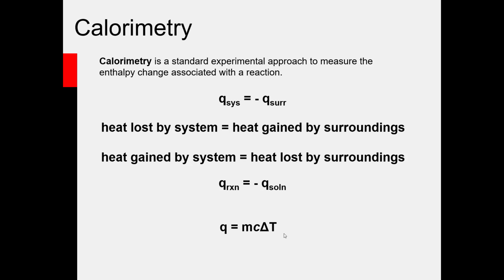So the calorimetry experiment then is if I know the mass of the water and the specific heat of the water inside the calorimeter, which I can look up, and then I know how much the temperature of the water goes up as the metal cools down, I can figure out how much heat flowed out of the metal into the water. And then I can calculate, for instance, the specific heat of the metal as a goal of the calorimetry experiment. So in a calorimetry experiment, we always use a calorimetry equation to calculate the heat flow. And if we know the mass of what we're interested in, the specific heat of what we're interested in, and the temperature change for what we're interested in, we can calculate the heat absorbed or released by whatever we're looking at.